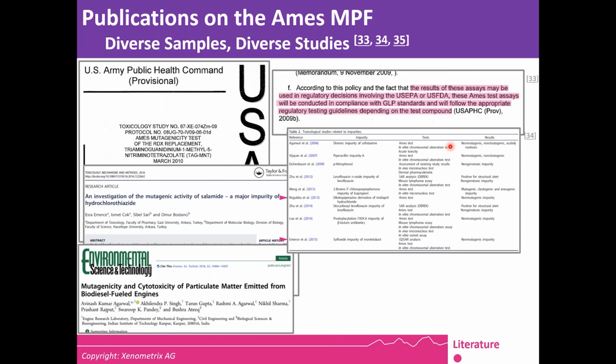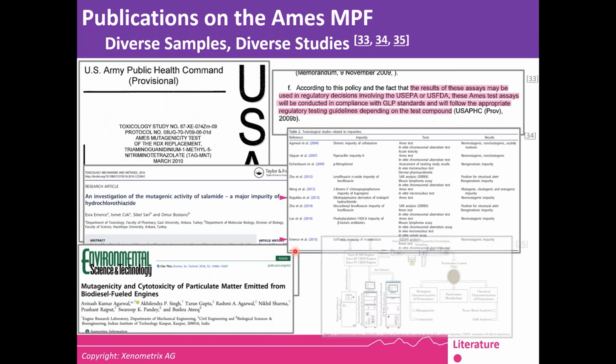For example, here there's a publication on a major impurity for drugs. And among the toxicological studies related to impurities, two of them, not only this one, but additionally two more, use the Ames MPF. And you can also use the Ames MPF for particulate matter, for example, for biodiesel fueled engines. There are a handful of papers on this.